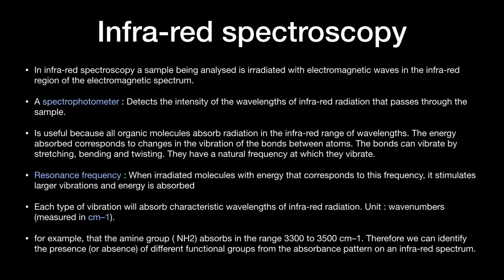The bonds can vibrate by stretching, bending, and twisting. They have a natural frequency at which they vibrate. When irradiating molecules with energy that corresponds to this frequency, it stimulates larger vibration and energy is absorbed. This is called resonance frequency.